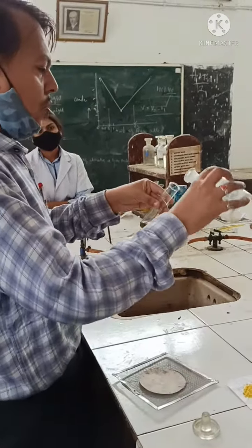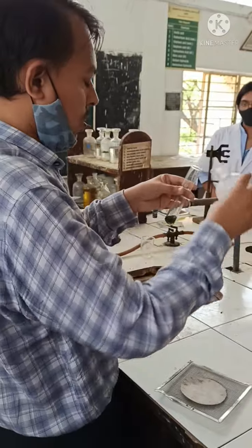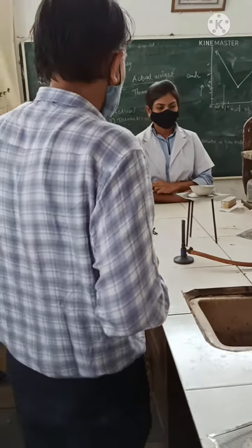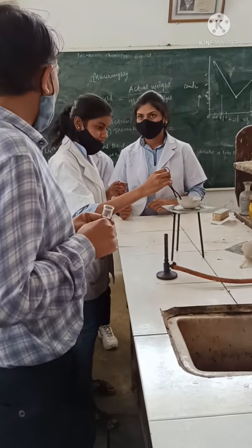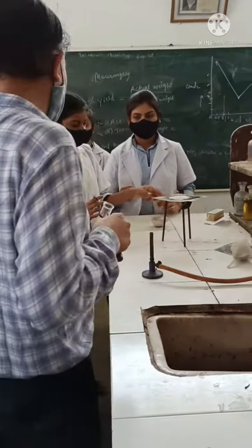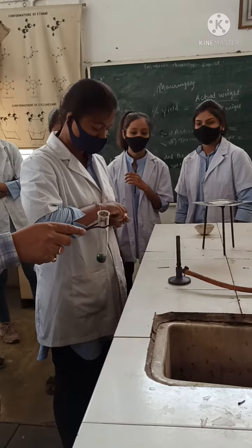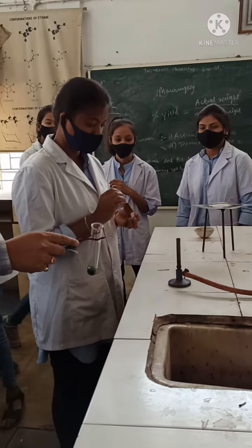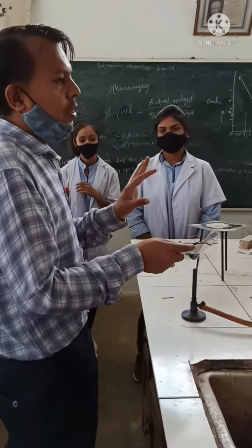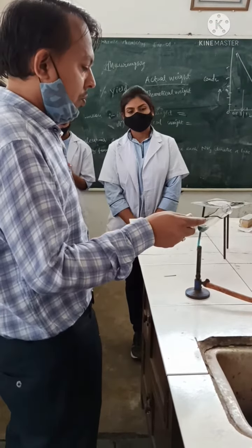And you have to add one drop of H₂SO₄ — one, two. After that, we have to boil it on the burner. You have to boil, not just warm. Okay? We will boil it on the burner, just like this.